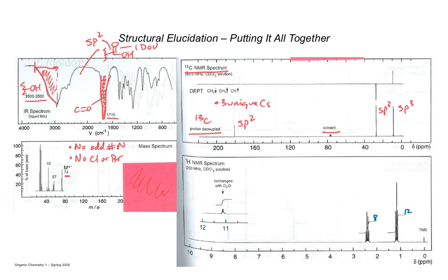Because they're sp3, what that's also telling you is they're fully saturated, right? So at this point, you have 3 carbons. I mean, you can bond them together and you're going to get the structure. So we won't just do that just yet. Let me point out some other things and you'll see how this ties into the proton.